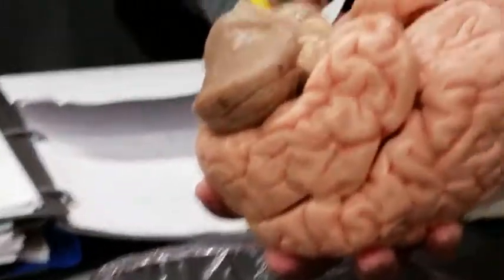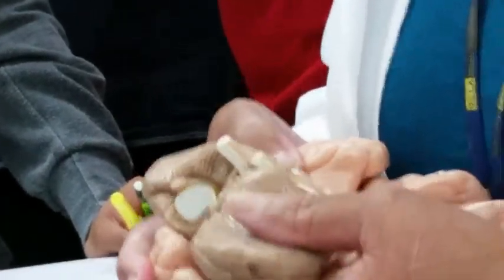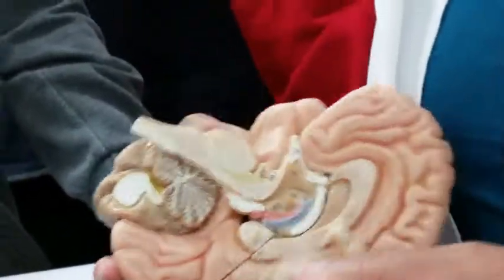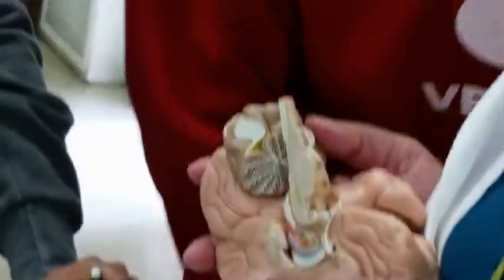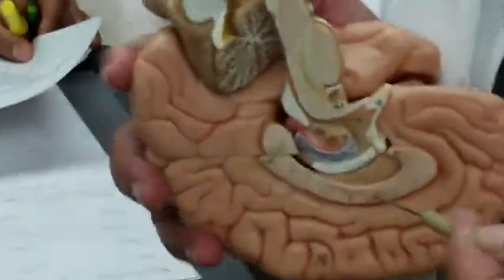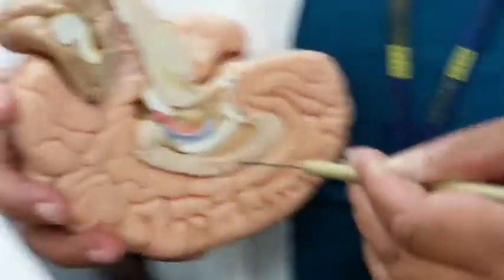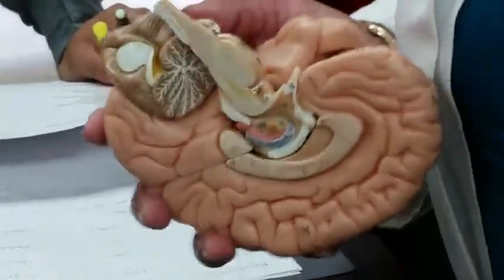And now we go to the, so now we open this, and we're looking at one half of the cerebral hemisphere, and name the structure. Corpus callosum. That's the corpus callosum. And now we put it back together.